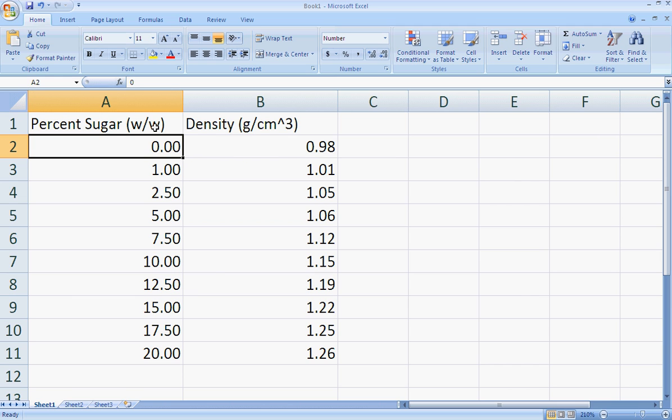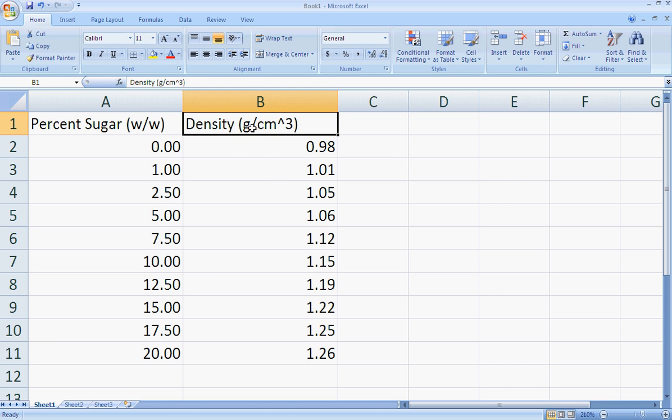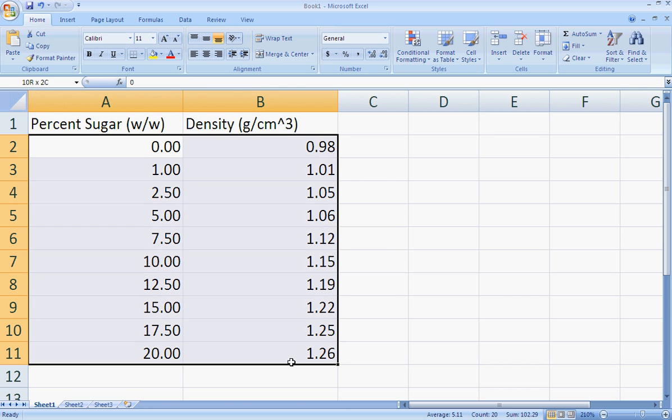I also put in my units up top as I labeled each of these columns. So I'm going to highlight the data that I want to use to create my graph, and I want my percent sugar to be on the x-axis, that's my constant value. And my variable value, my density, is going to be on my y-axis.